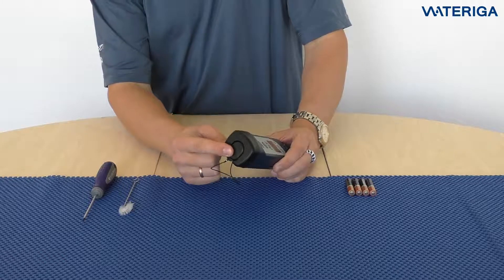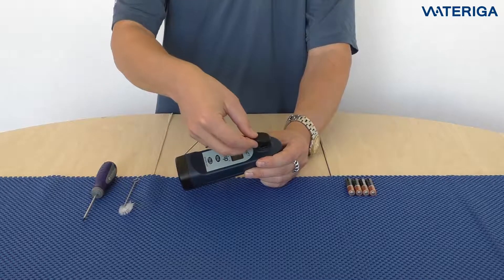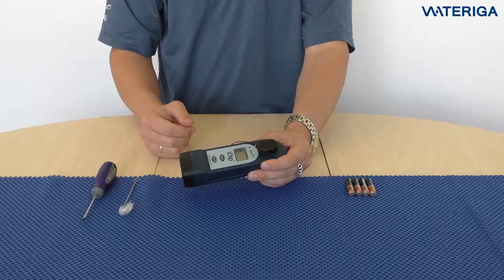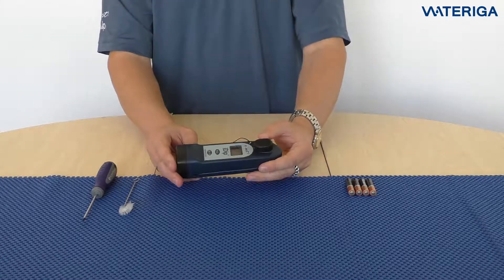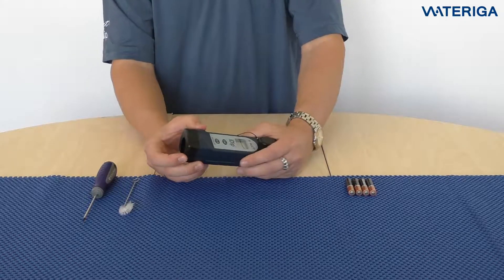At the bottom of the i-Dip you have a cap. You can use this cap for zeroing and reading the results to avoid light interference. You can also use this as a mixing cap when mixing the sample for different tests where you need to use a powder or a liquid.